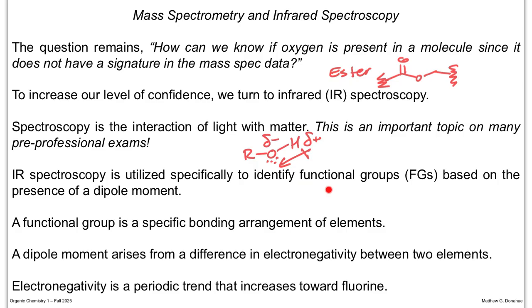So you have a stimulus and a response. The important thing to note is when you see a signal in IR, there has to be a dipole moment. And that can get pretty tricky when you're dealing with, again, specific types of carbon-carbon bonds: single, double, and triple. You don't always see them because if two of the same element, they have the same electronegativity, the magnitude of the bond dipole is not that great.